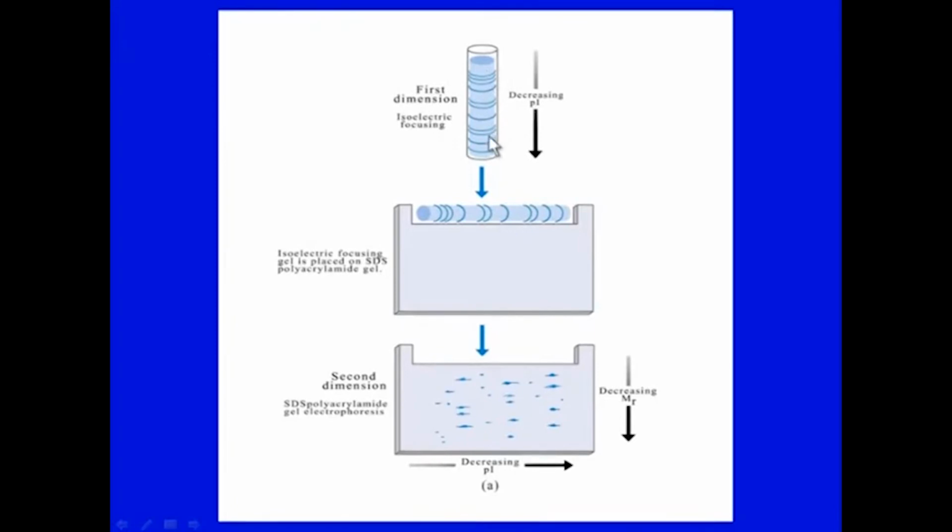In this figure, the first thing you have done is isoelectric focusing, and you can see various bands of proteins after staining. If you do not want to stain, that is also all right, but one time you can see that it is doing well. Then you lay this gel and it will run. Now, you have run in this direction and now it will run in this direction, at 90 degrees to the previous run, on a stacking gel.